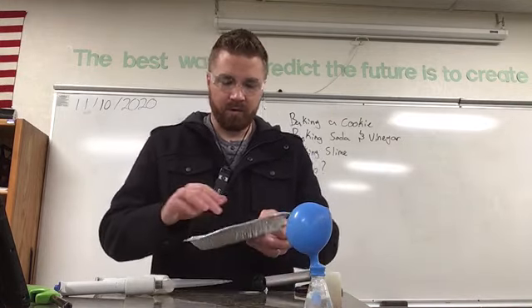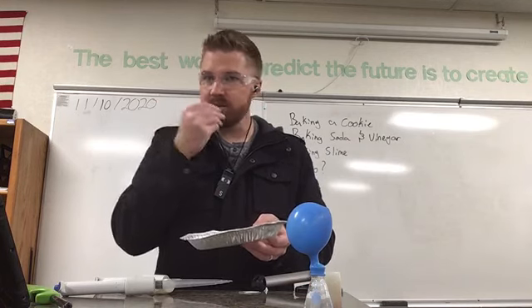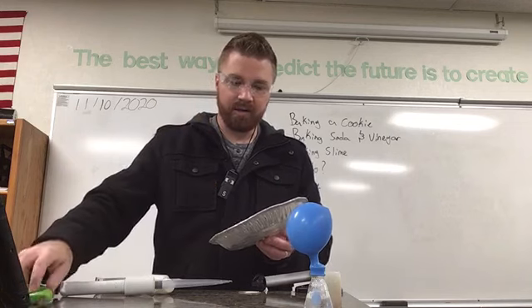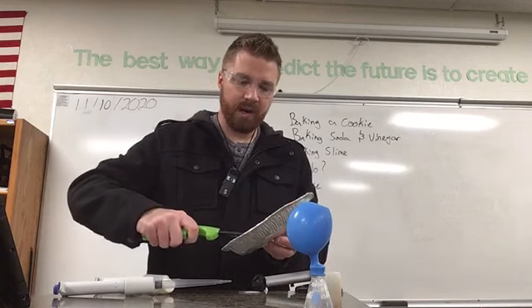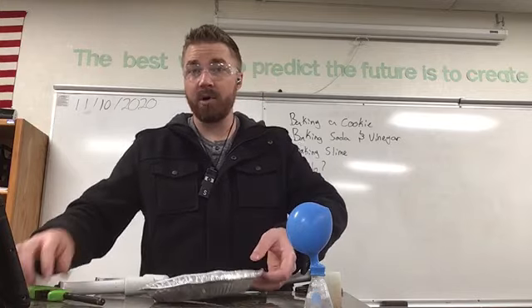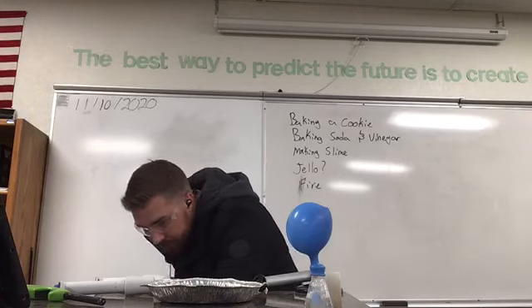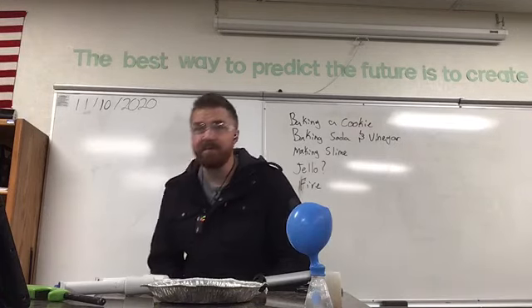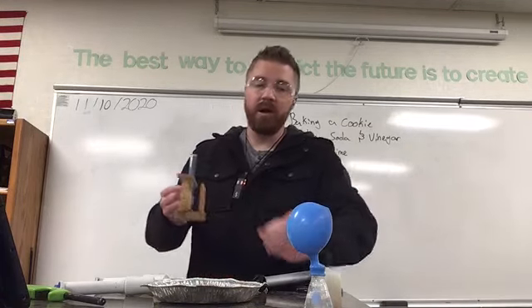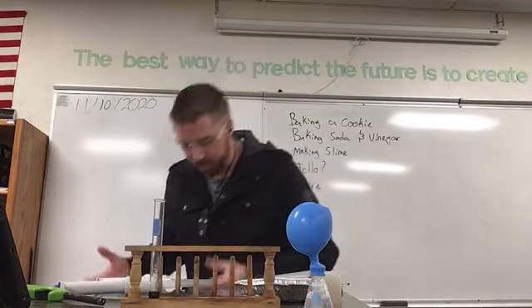Okay, so no more flame, but actually there is some residue here. It doesn't smell like alcohol, and if I try and burn it, that remaining residue is not flammable. I can't get that to burn. So that's a change in property. Okay. The next one I want to do, and I'm just flying through these, so if you need to be pausing this video so you can do this on your own and keep up, then please do so.